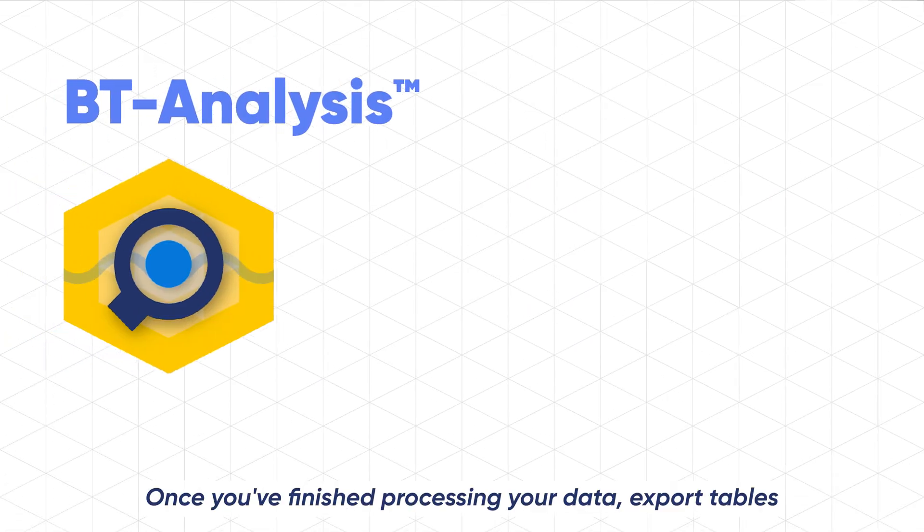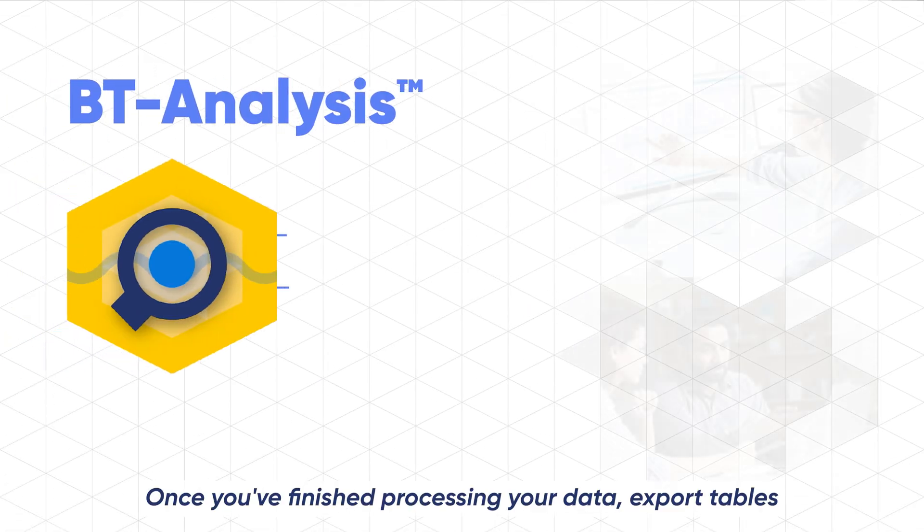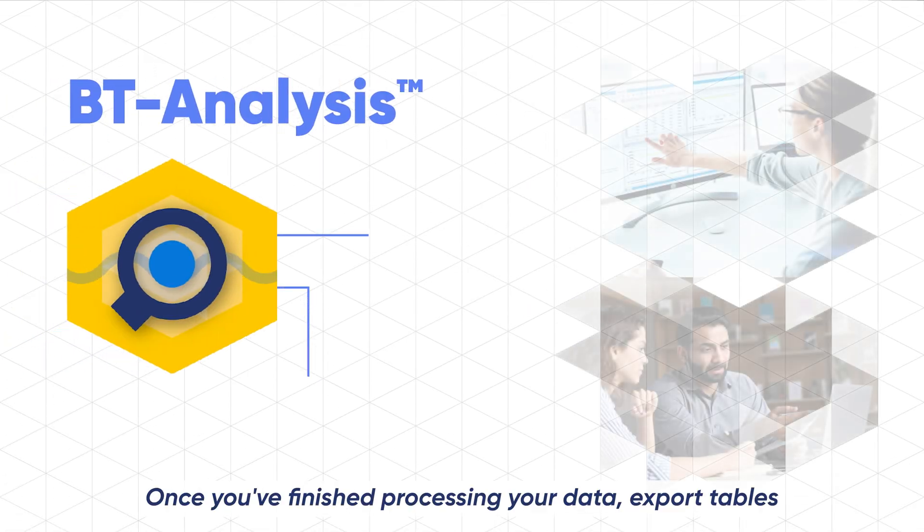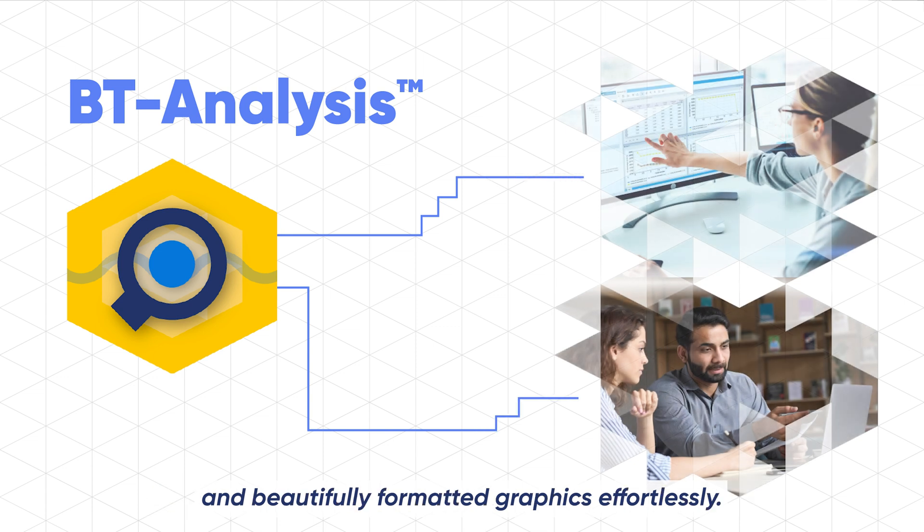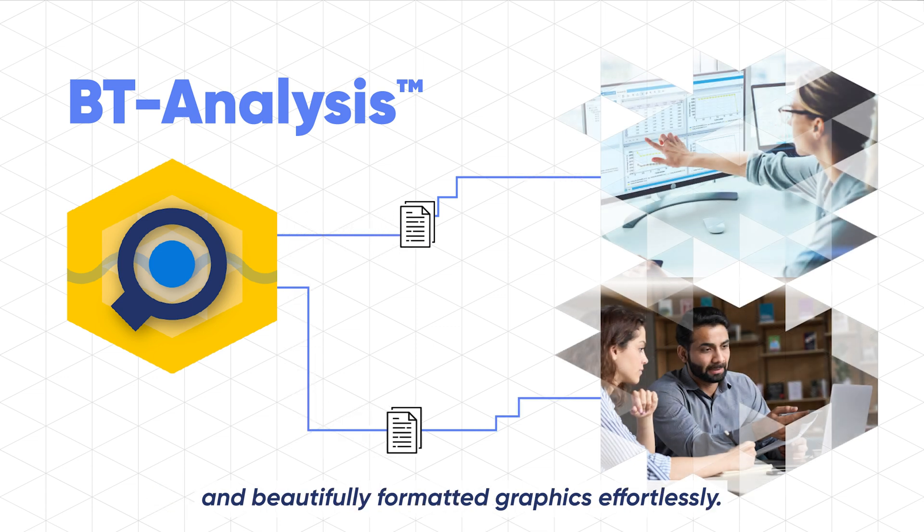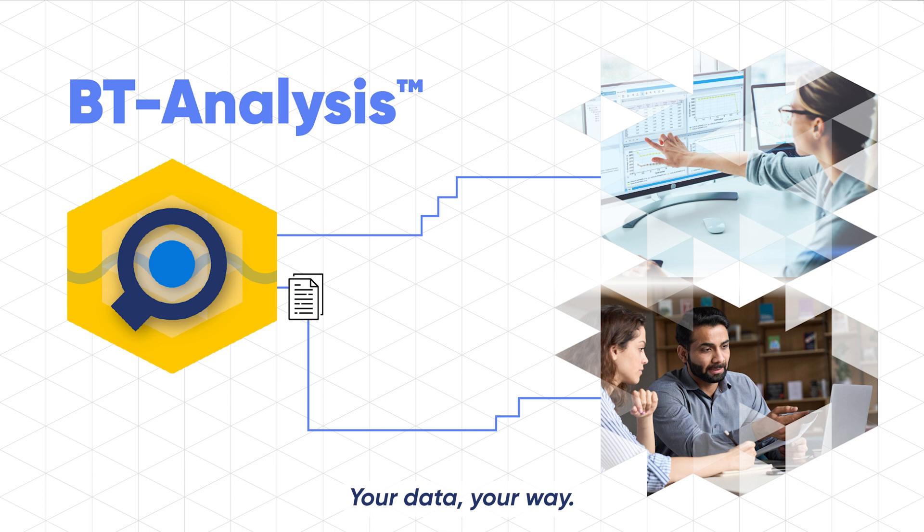Once you've finished processing your data, export tables and beautifully formatted graphics effortlessly. Your data, your way.